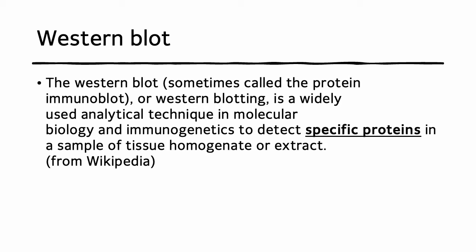To start with, I'd like to briefly go over the definition of Western blot. Western blot is the process to detect specific proteins in a sample of tissue or cell lysates, which is cultured in vitro or other things. In most cases, you make a sample with the cells after inducing lysis on the whole cell. So in the sample, there are going to be all the proteins from the whole cell.